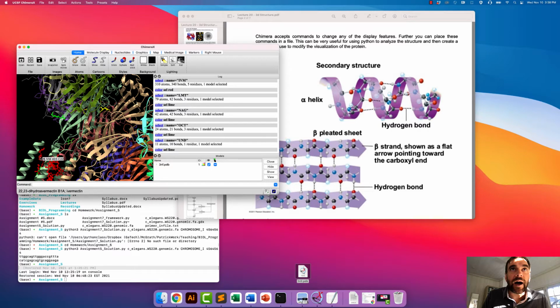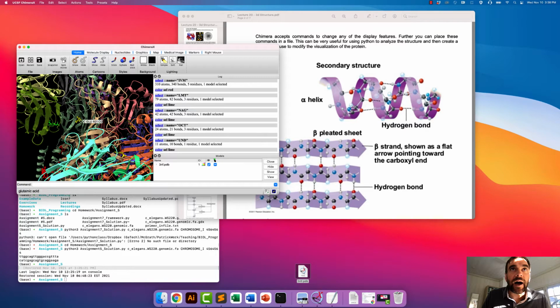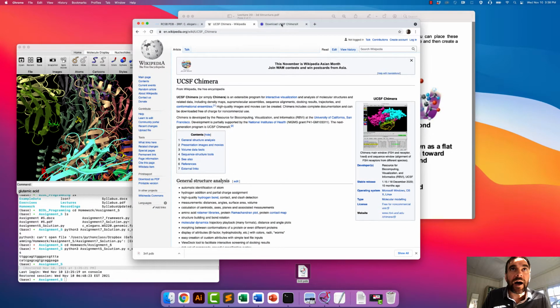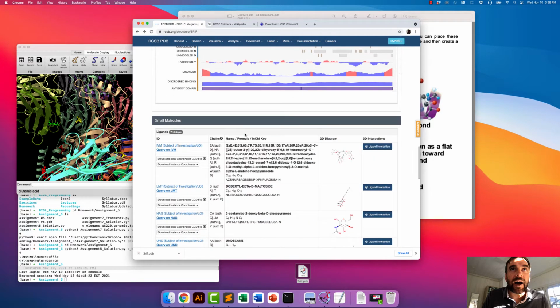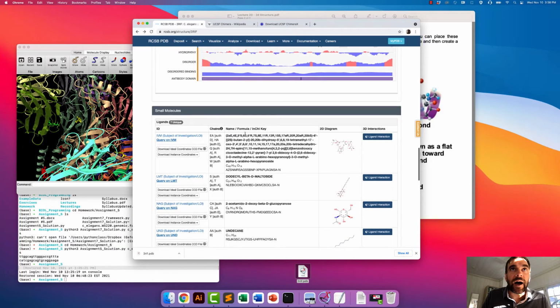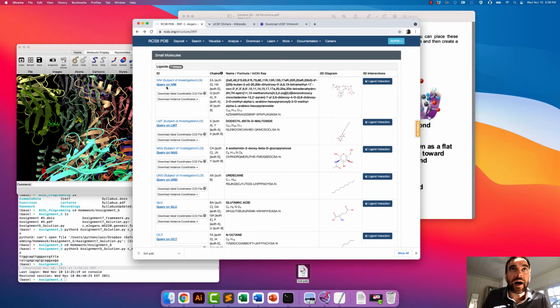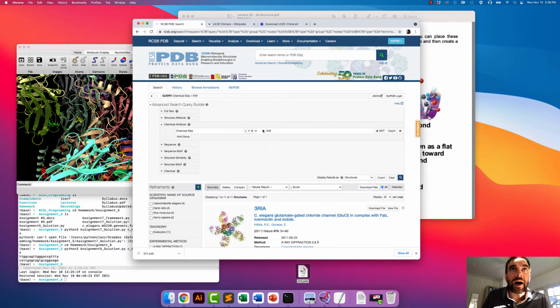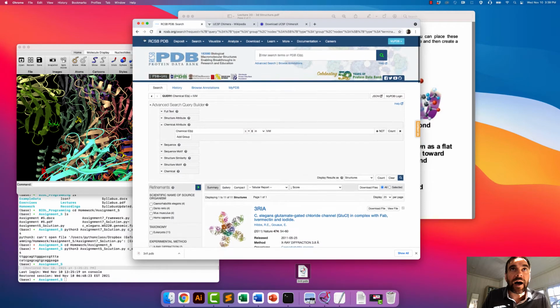So they have the residue number 403. And then the glutamates are right here, and they have the residue number 401. And if you go down to here, oops, that's not what I wanted.